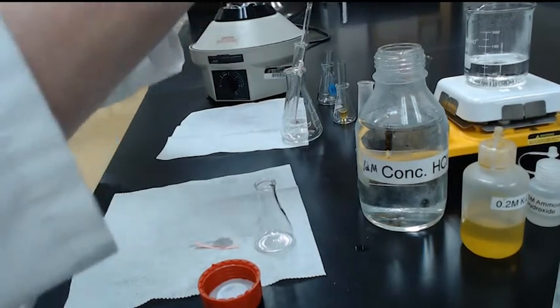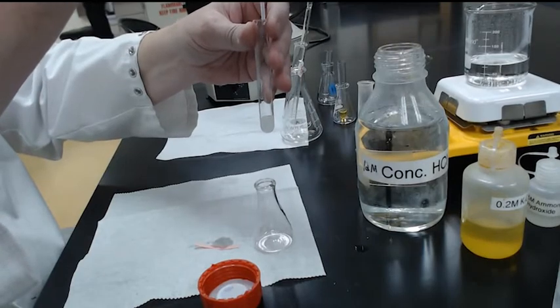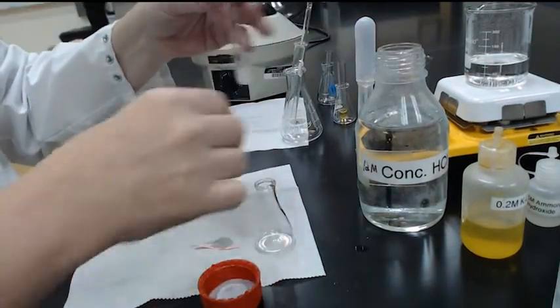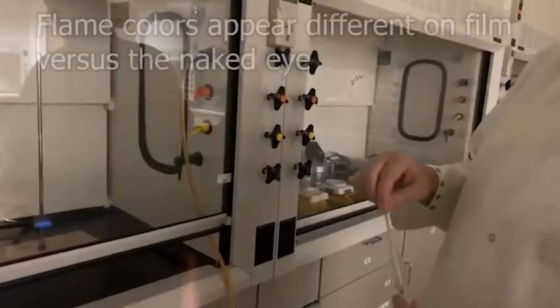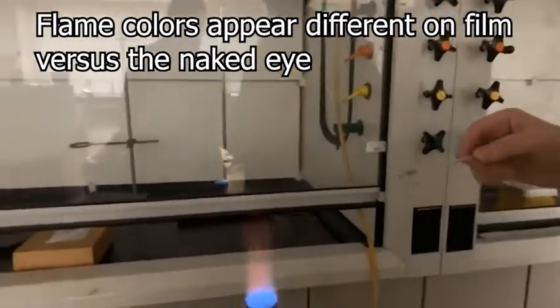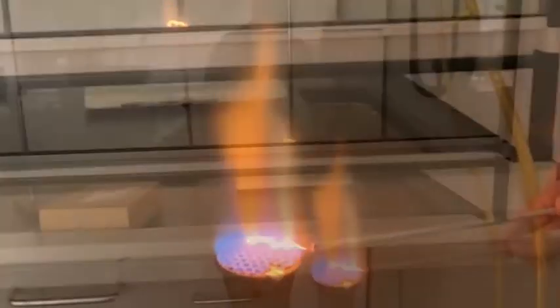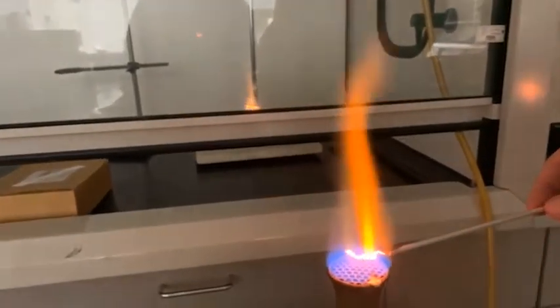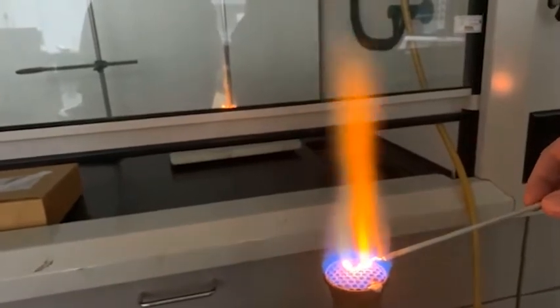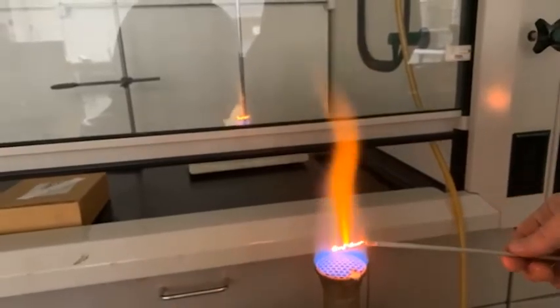Well, there should be enough of this dissolved to be able to do a flame test with whatever is in here. Now we're going to try the flame confirmation test for barium. We have this mixture and we put it in there. We're looking for a yellowish green glow that's not orange, so look carefully. Do we see a yellowish green glow? I think we got it. Okay.